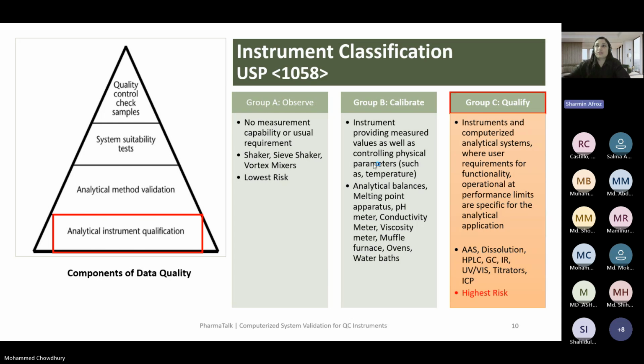You can also go through the water conductivity chapter 645 and pH chapter 791. But from what I have checked, there is no need to calibrate the system at a yearly or 6-month frequency. A performance check before operation is enough.